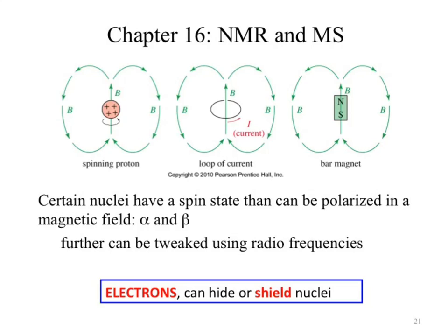But what we can use with that information is look at the intensity. Because if I have more magnets in that area, it's going to absorb more of that energy. So the intensity of my signal now changes. So we can start to evaluate how we can see just a chemical environment. We can also look at how many of those hydrogens are present.